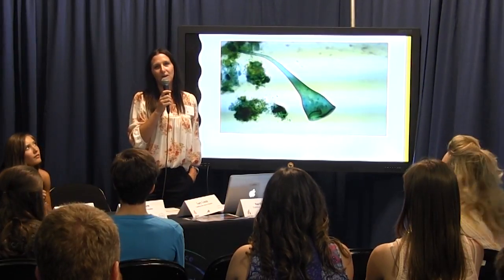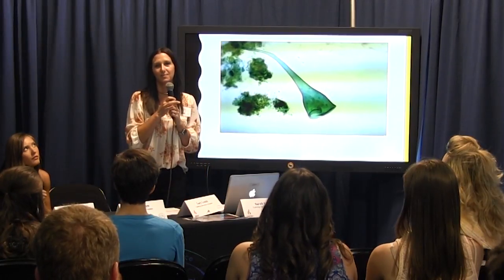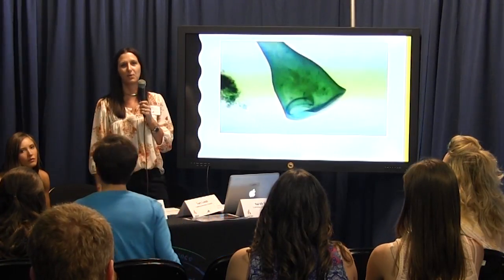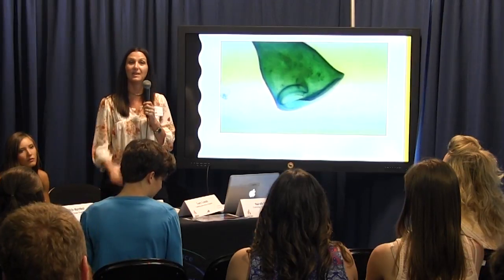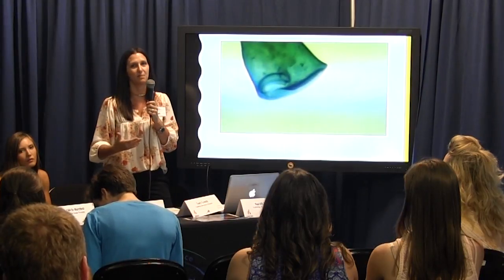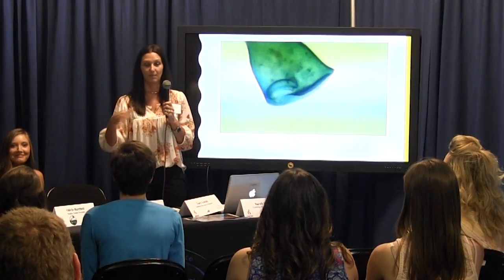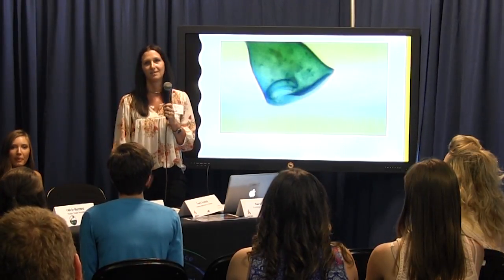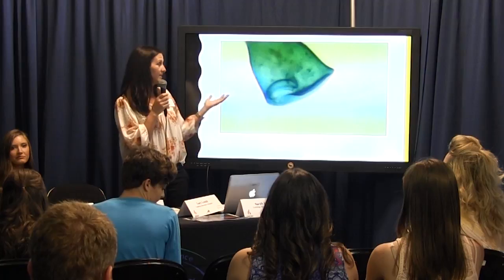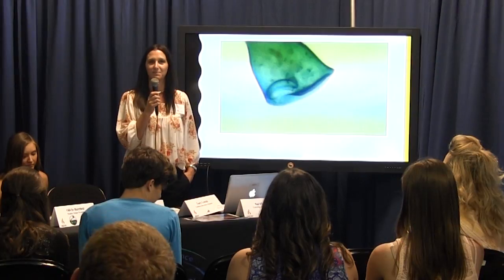We haven't, no. I actually just ordered live organisms from Carolina, and I picked a few out and we went from there. But I would like to do, maybe next year, we can go out and collect some of our own samples. But they also learn that you've got to be patient. The first sample, you may see nothing. You may have to spend 2 hours and sample nothing. Clean it off, sample nothing, you know? But there were some living things we couldn't figure out what it was, so then we had to identify those. But it's pretty cool.